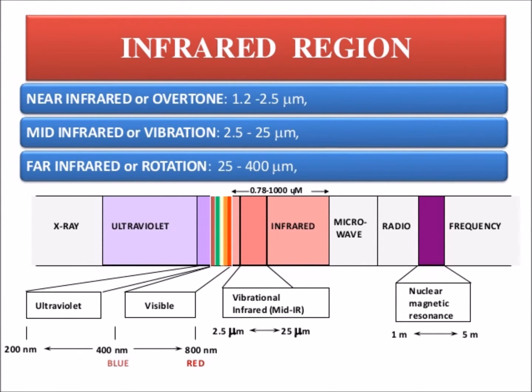The first commercial infrared spectrometers were available during the 1950s. These IR spectrometers utilized prisms to disperse and select different wavelengths of IR radiation, but were largely limited to the narrow region between 4,000 to 700 wave numbers. Grating IR spectrophotometers were subsequently favored over the early prism monochromators, but suffered from high cost and slow operation.